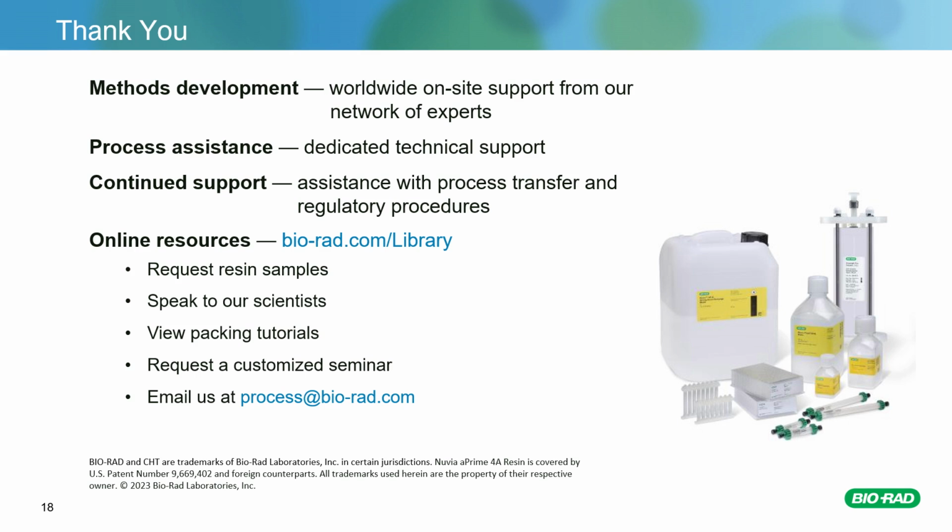So residence time, loading range, and collection criteria normally also play an important role. In case of CHT media used in the bind and elute mode, the pH and conductivity of the load, but also elution, are important. In this case, also residence time, gradient slope, loading density, and UV collection criteria are the factors that should be evaluated.